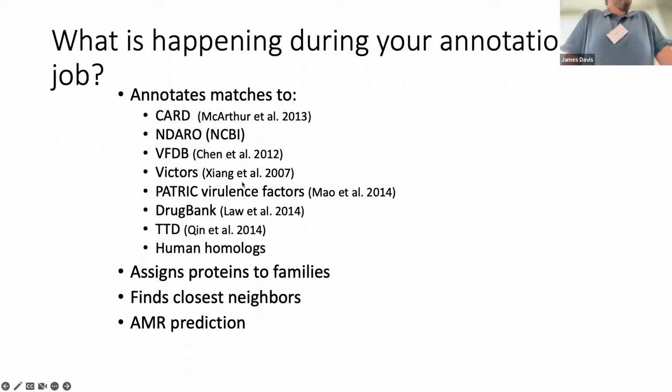So if I'm understanding correctly, your annotation pipeline doesn't use a reference genome? No. Well, there's nuance. If you gave us an identical genome to one we did previously, it will inherit the annotation faster that way. I think it still does that, doesn't it? No, it used to. RAST does that. Okay. So I work with E. coli, right? And if I were to use PROKKA to annotate an unknown clinical sample and I fed it MG1655, that wouldn't be great, right?